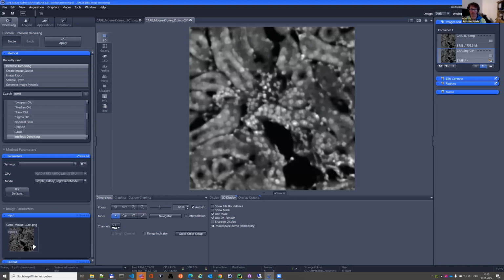But in our case, it's really useful because in our ecosystem, it ensures that the output of some AI processing can be basically used in our software seamlessly. And then we have the CZmodel package. This is a unified way to package trained machine learning models, not only for segmentation, but also regression and some other stuff. You can read it in the specs.